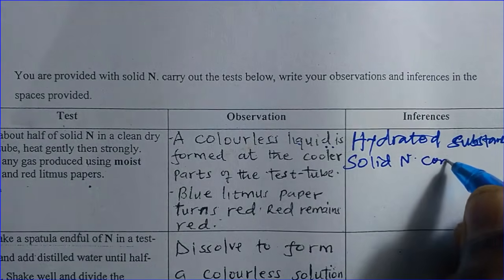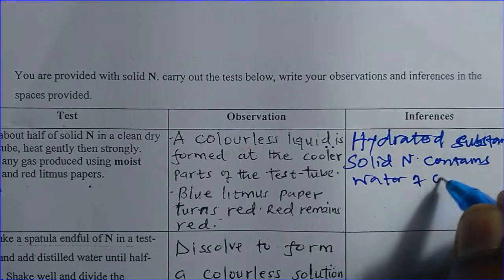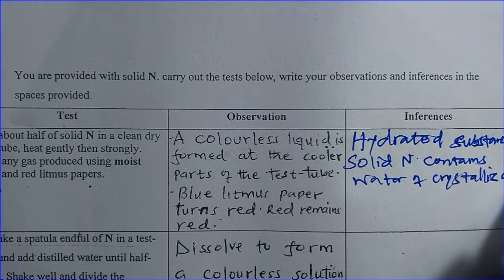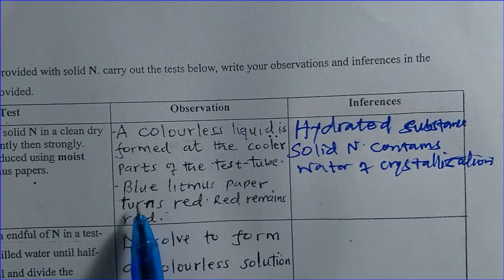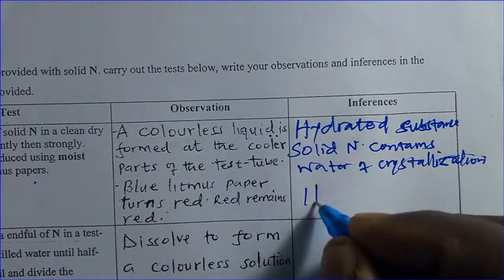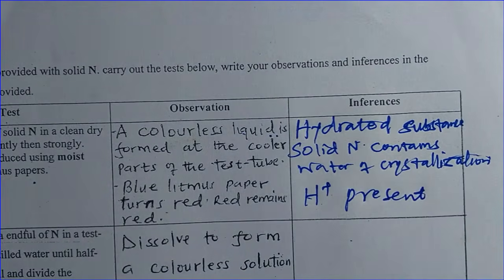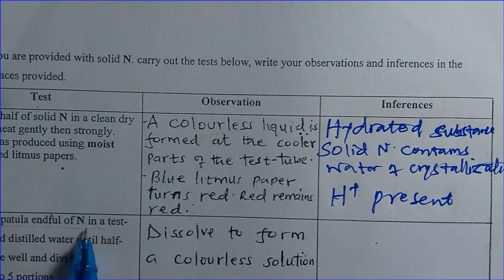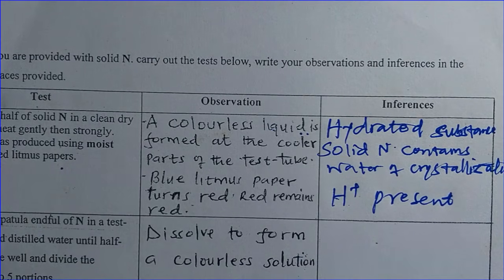Solid N contains water of crystallization. On the blue litmus paper turning red, it means hydrogen ions are present. Take a spatula end of N in a test tube and add distilled water until half filled. Shake, divide the solution into 5 portions.